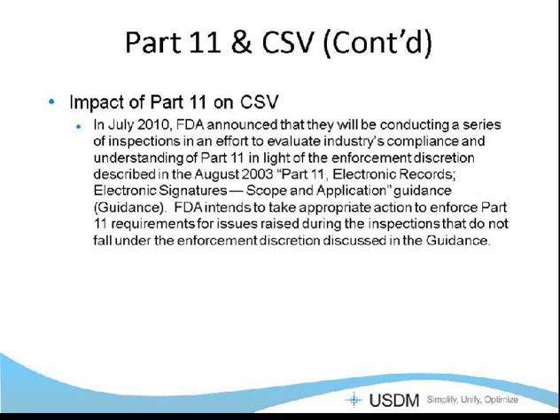And in addition to that, they're writing 483s for findings now, which they had not done previously. So over the last year or two, we've seen a vast number across the board, from laboratories through packaging facilities, everywhere, where the number of Part 11 deficiencies has increased. Mainly, I would say that's trending towards documentation of practices, how you do things, training records, and actually complying with the procedures that you write.